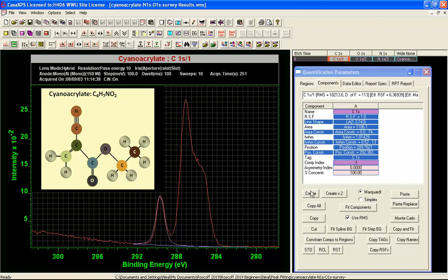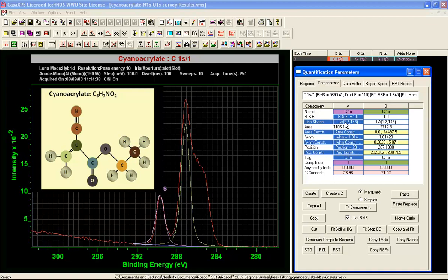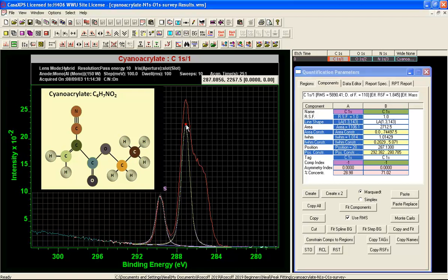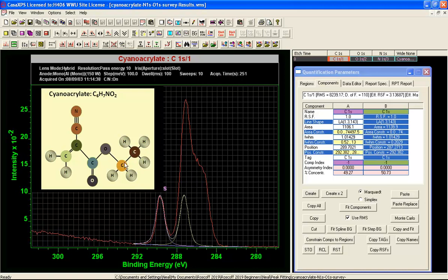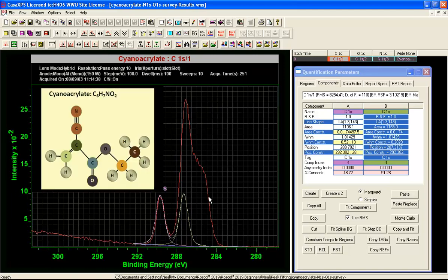And then since we have a carbon single bonded to oxygen and these are all part and parcel of the same pattern within this material then another guess would be to add a second peak. And we'll use a similar line shape. And this second peak would correspond to the carbon single bonded to oxygen and we've got hydrogen and carbon again. So this one is offset in binding energy with a characteristic offset that might look something like this. So you have to understand that these are educated guesses based on other materials mostly from the polymer database.